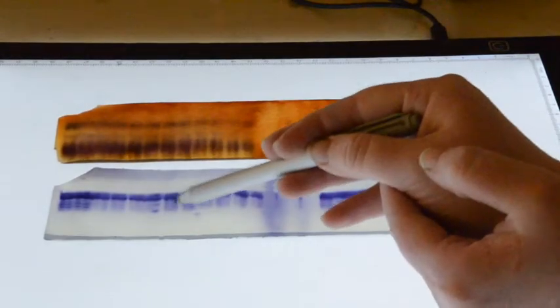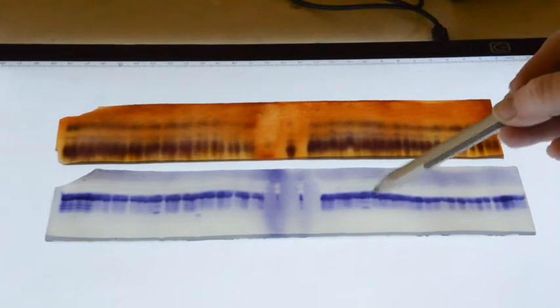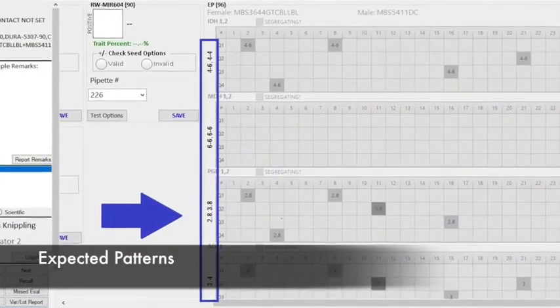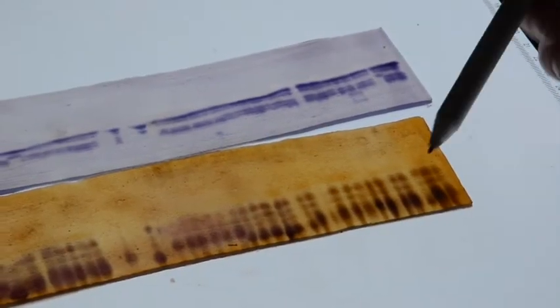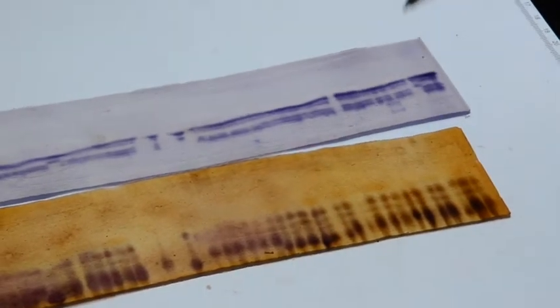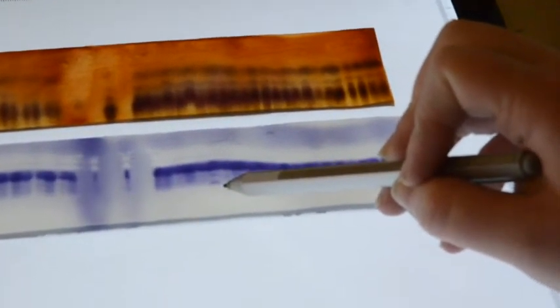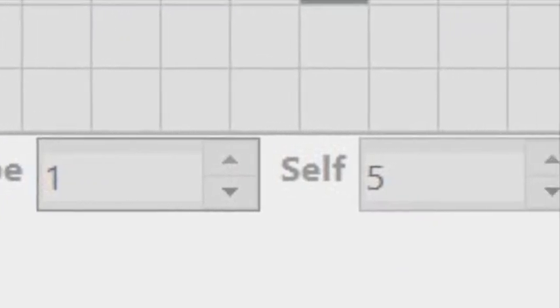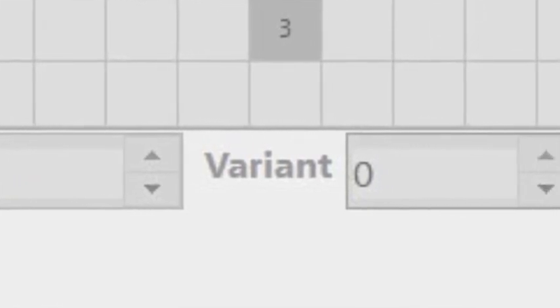Trained staff evaluate the different stains to determine genetic purity for the sample. Based on the female and male inbred patterns, the expected hybrid pattern can be determined. Individual seedlings can have different banding patterns from the expected hybrid pattern, such as an off type — a seedling with an unexpected pattern in two or more stains — or a self, which is a seedling with the pattern of the female inbred in two or more stains.